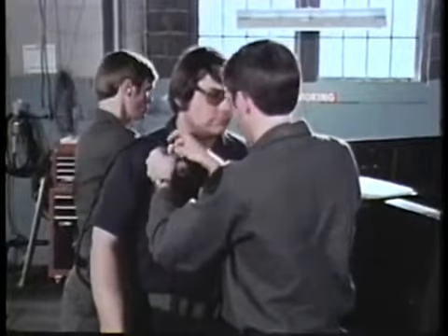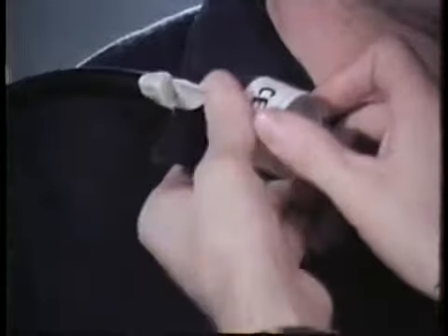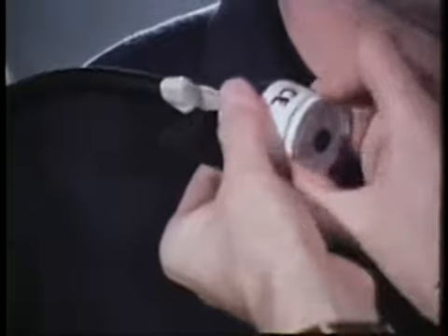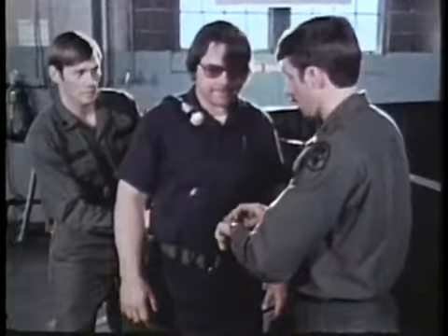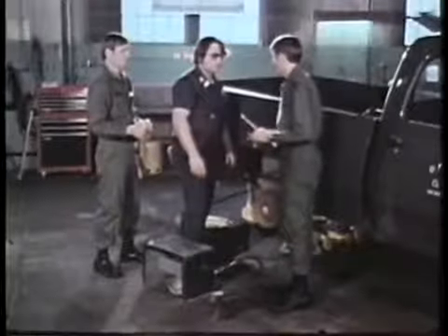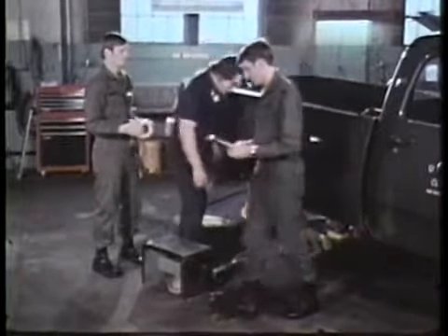An open-faced filter cassette traps any asbestos fibers that may be in the air. The air sampling pump will draw air through the filter. Record the starting time, and when you're done, the stop time. In between, check the flow rate on the pump periodically.